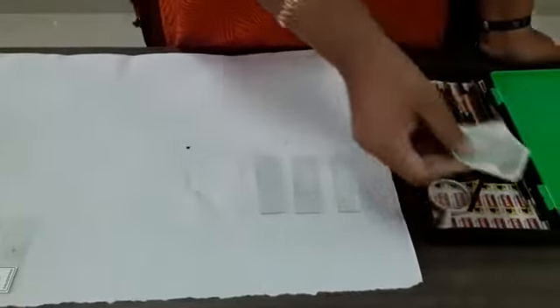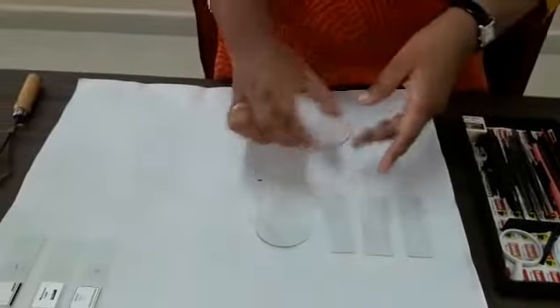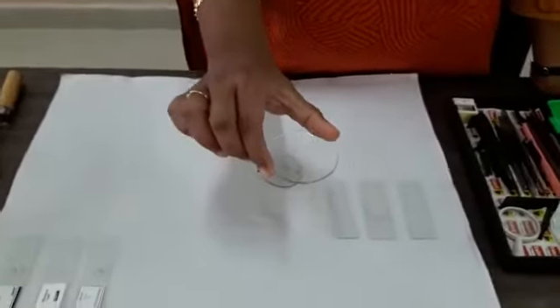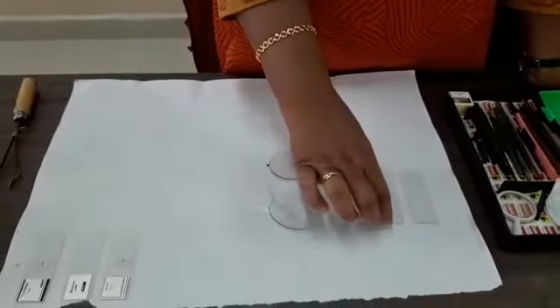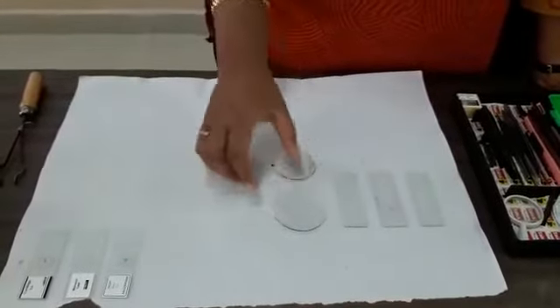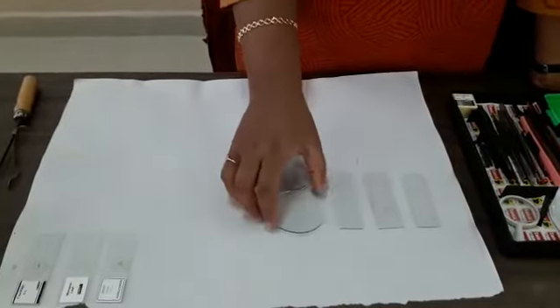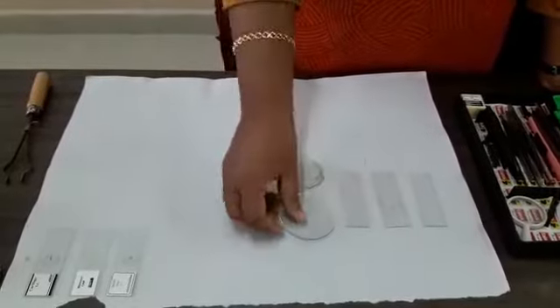This is the watch glass. You can see there are two sizes — one bigger and one small. To prepare the stain, we need this watch glass. Slides are used where we do the mounting; whatever specimen sectioning is done, it is done on the glass slide. To prepare the stain, or if you want to take any water, the watch glass can be used for many purposes.